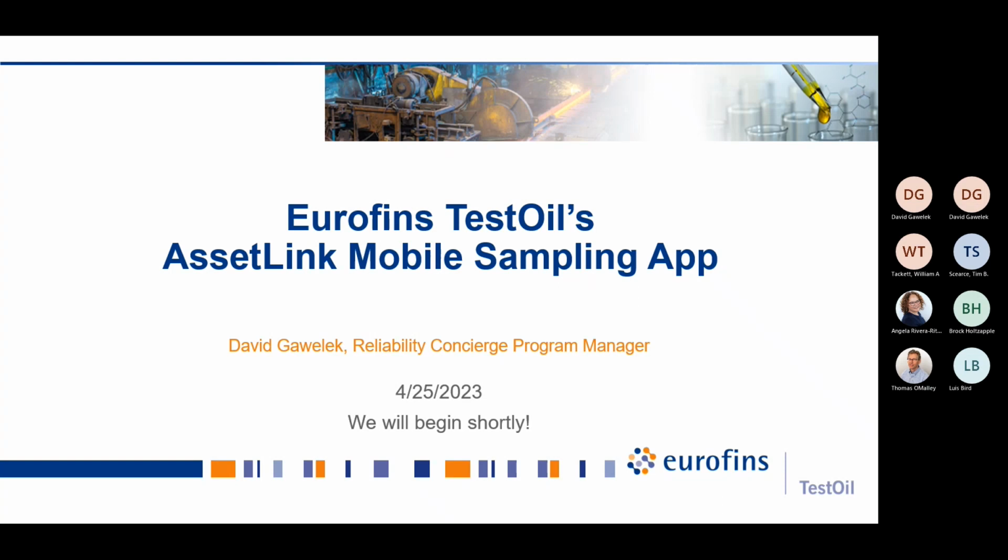And one of the most common feedbacks that we received was we need something to improve our workflow and improve the efficiency of our communication, whether it's communication from you, the end user, to TestOil regarding information about the machines, the assets in the program, the lubricants they use, et cetera, or from us to you, which would be report results, program trends, alerts. And then there was some opportunity also for us to help you communicate within your own organization about this program and the work that's carried out to facilitate an oil analysis program.